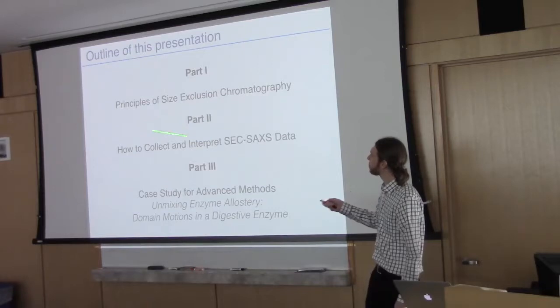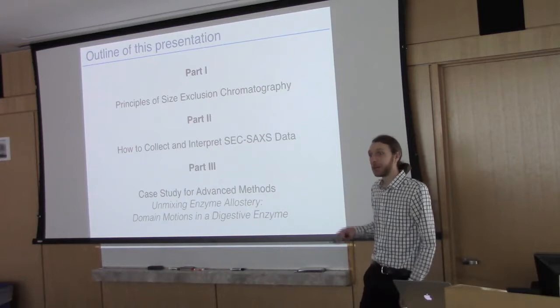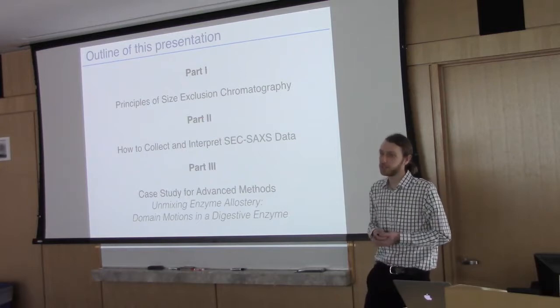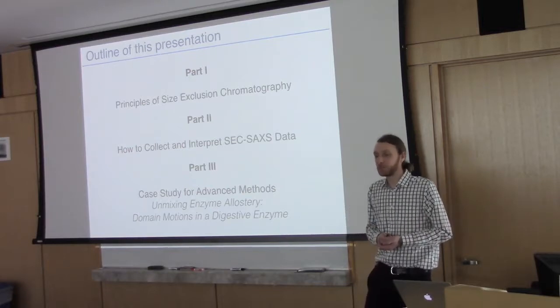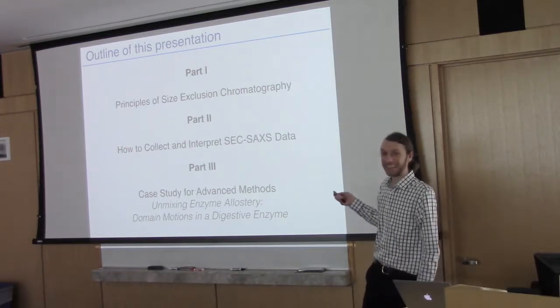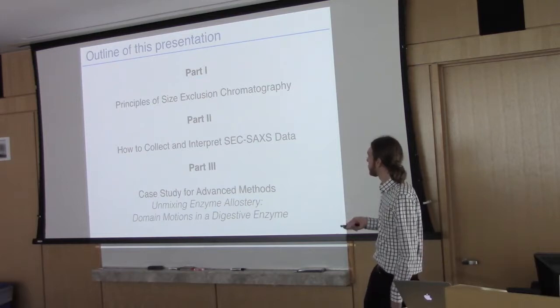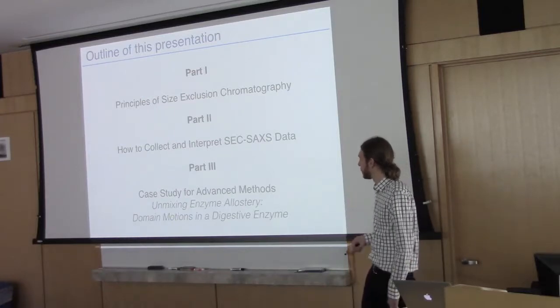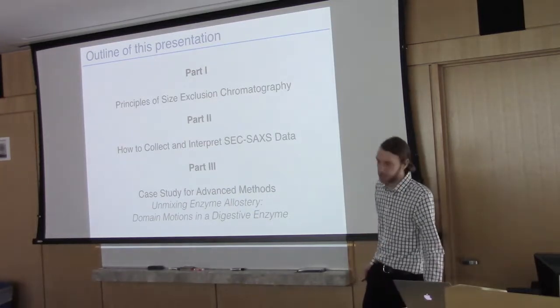In this presentation, the first part, I'm actually just going to go through what size exclusion chromatography is. Most of you are probably using it in your protein purification, so you sort of know how to do it already, but I'm a little sensitive because I was a physics student, and when people talked about SEC, I had no idea what they were talking about. So for those of you who are physics students, this is for you. Part 2 is how to collect and interpret SEC-SAXS data. And in part 3, I'll go into a case study, which is really about protein allostery and regulation.